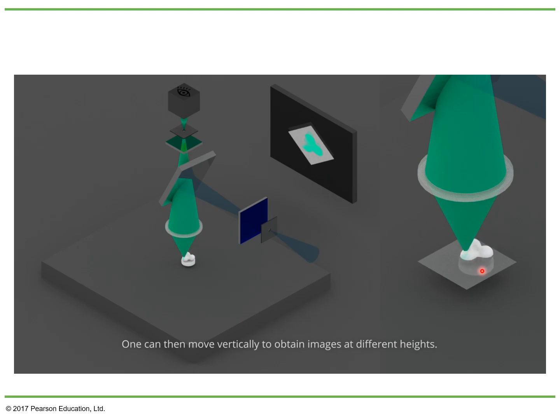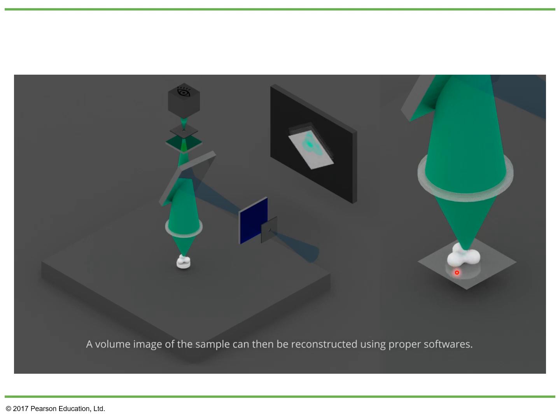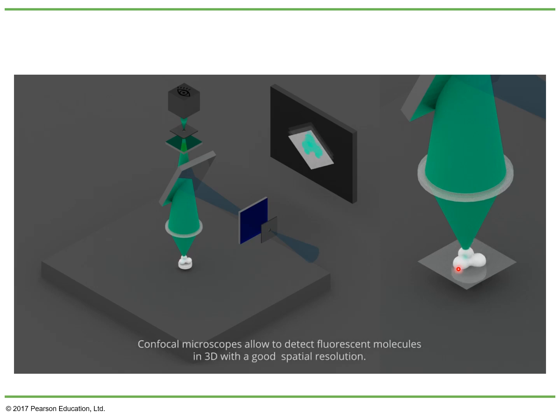While with the other picture you just have one picture, here you are going in 3 dimensions. You're going to go in the x-axis, in the y-axis, and also in the z-axis. So it's very useful, it's very pretty, but while the other picture will take 10 seconds, this one can take minutes, 2 minutes to take, or even longer.